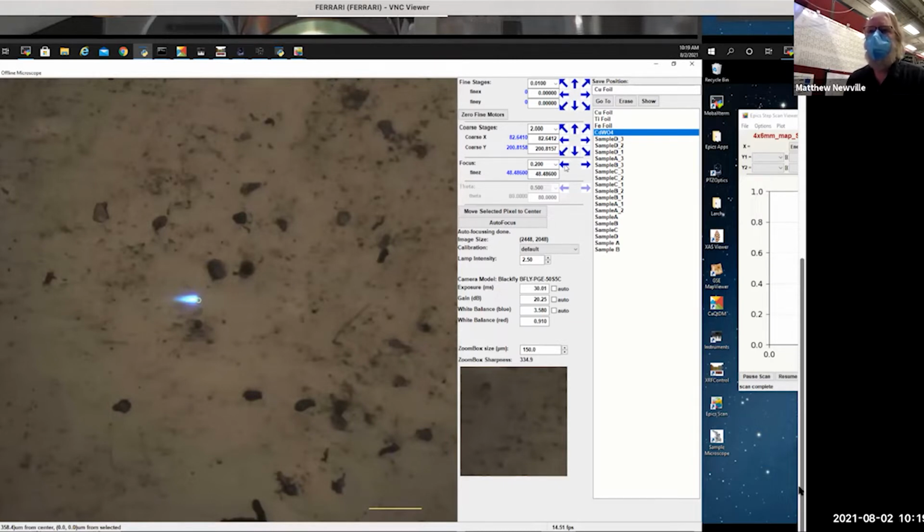So our knowledge of where the beam is in the horizontal is a little worse than in the vertical. You can also see the beam does not look at all round. It's got this tail on the left side. That's also the downstream side, and it's the side through which the X-rays would penetrate deeply into this crystal. So the visible light we're seeing here is fluorescence, in the blue light regime, from this sample. Right now I'm at exactly 10.1 keV.